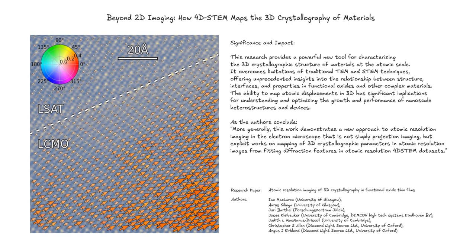They discovered that the lanthanum atoms in LCMO weren't randomly displaced. They exhibited coordinated antiparallel displacements, meaning neighboring lanthanum atoms shifted in opposite directions. It's amazing how these seemingly abstract parameters can reveal such concrete information about the material's structure.